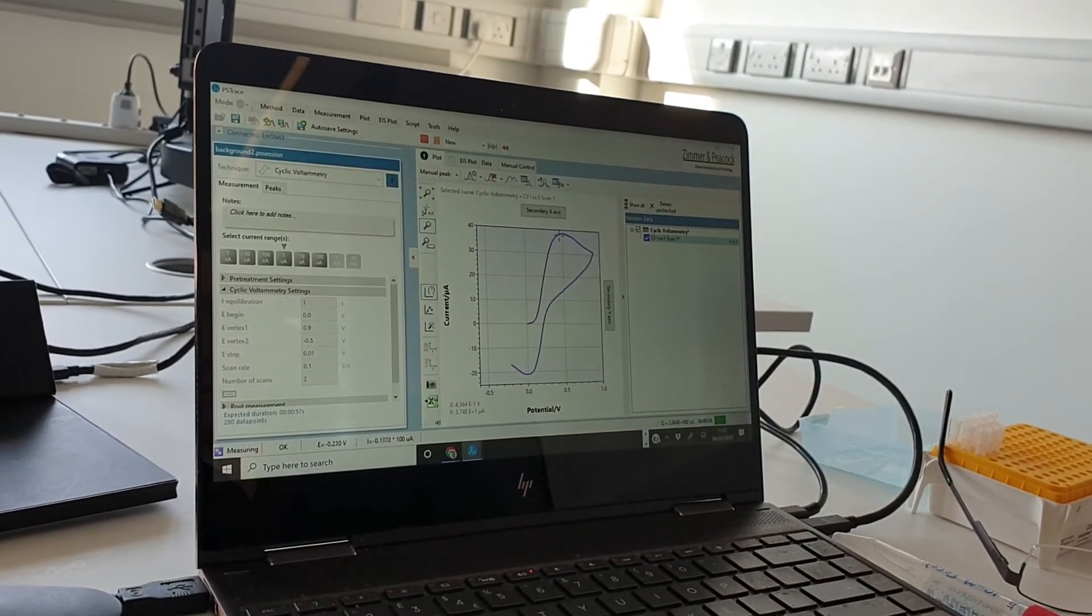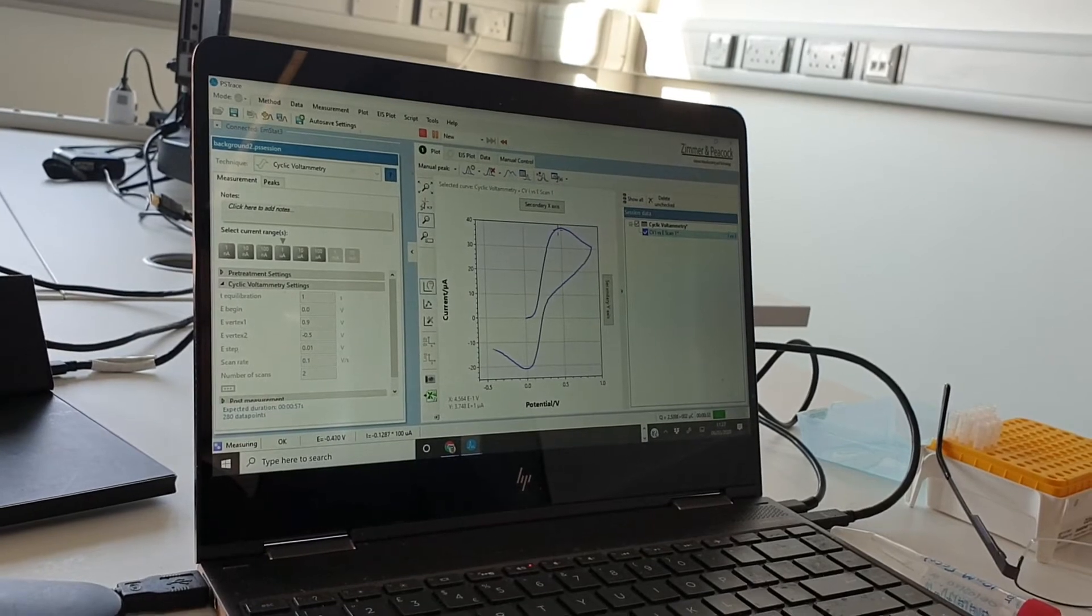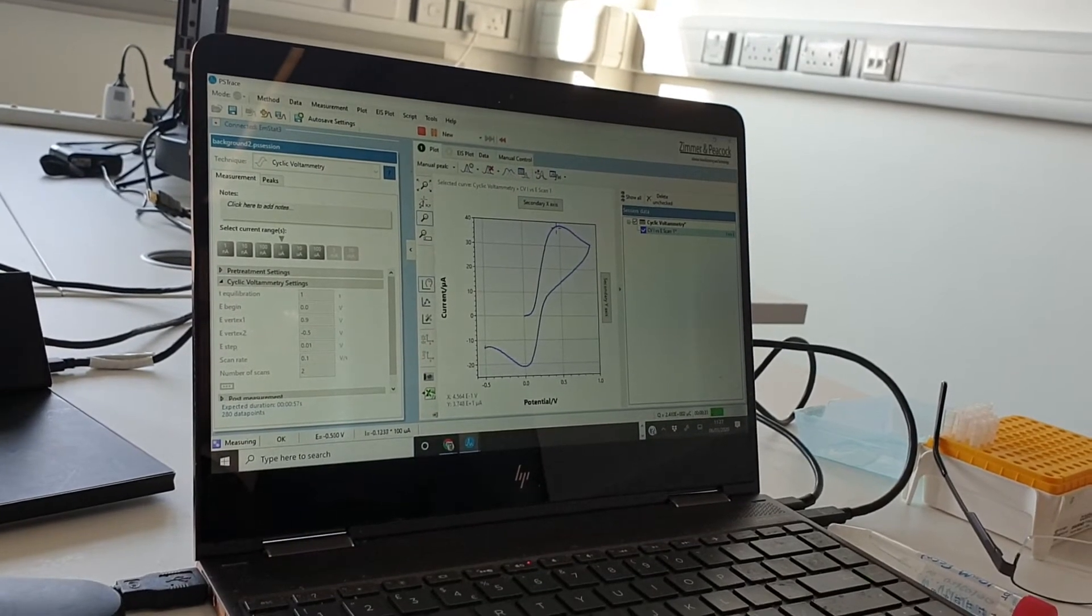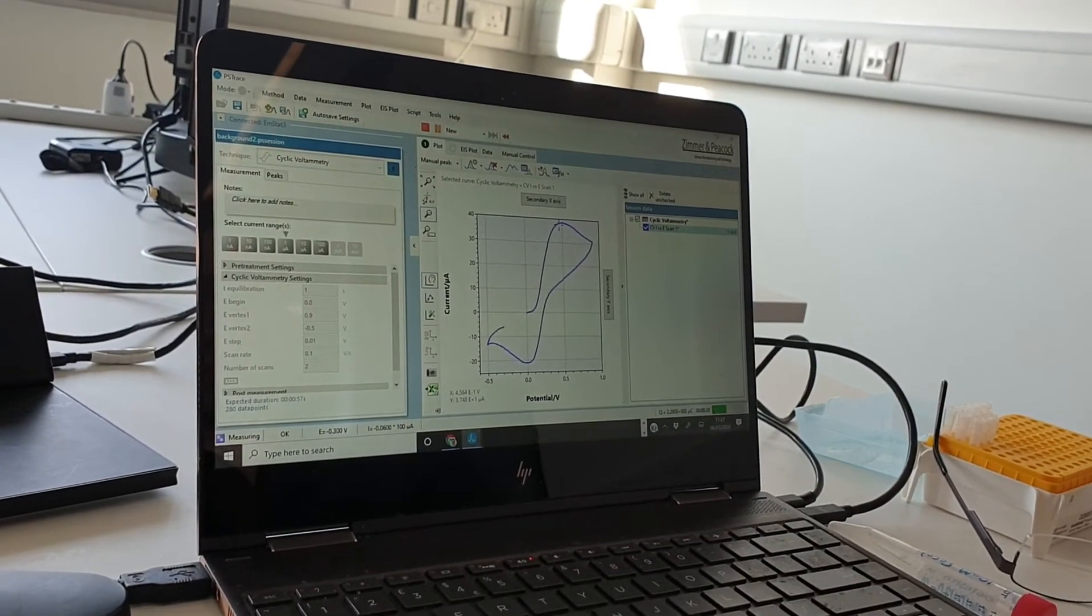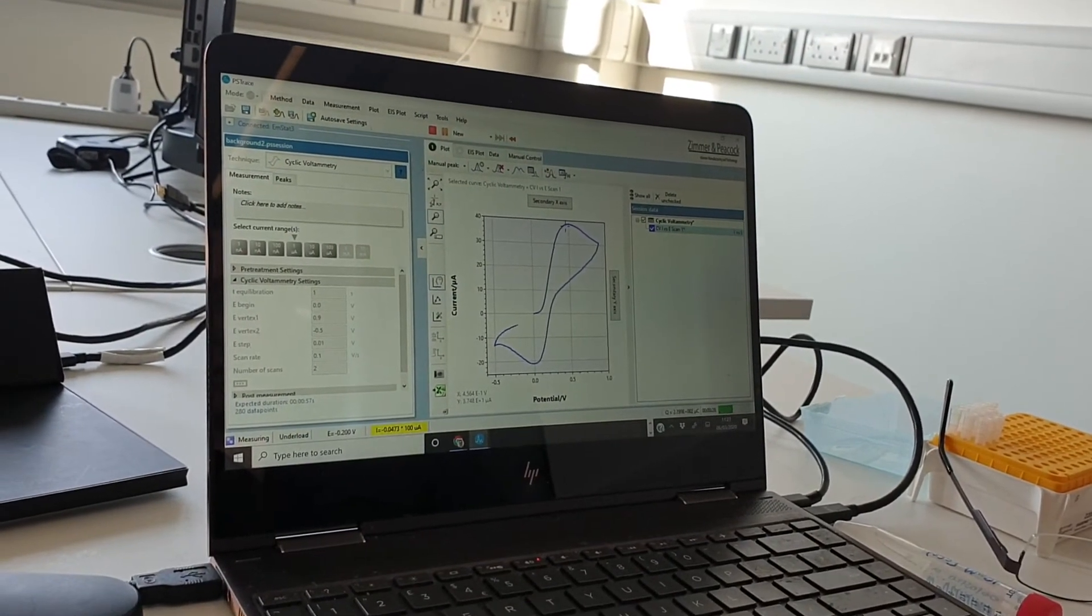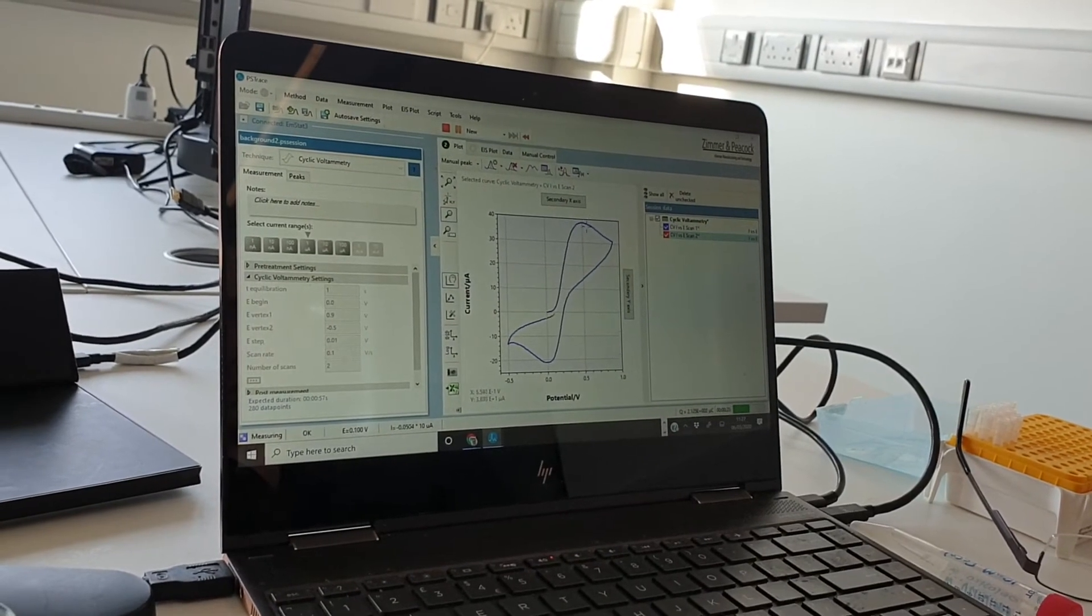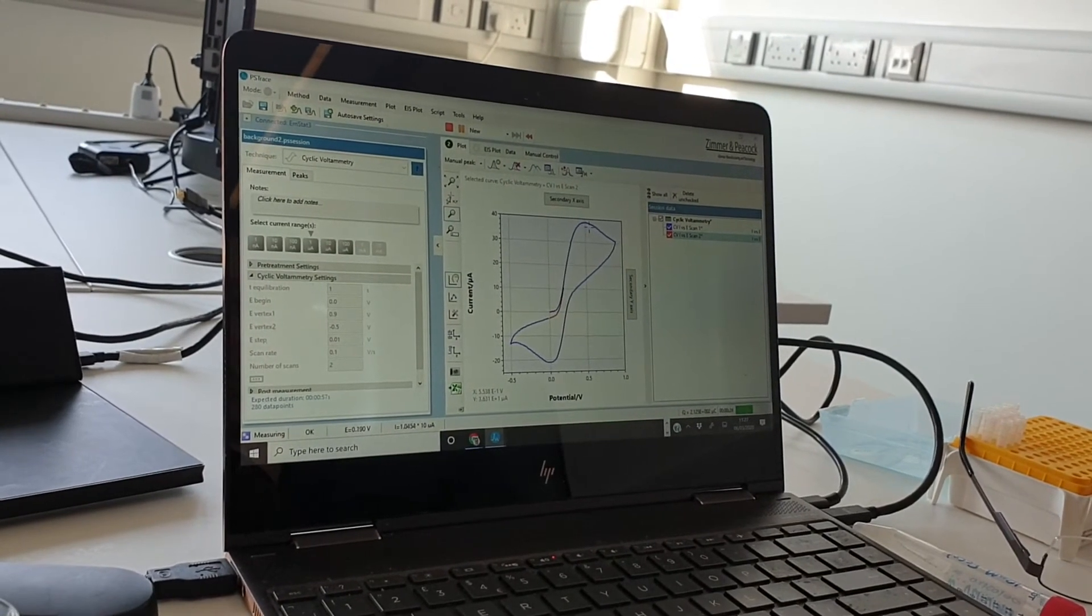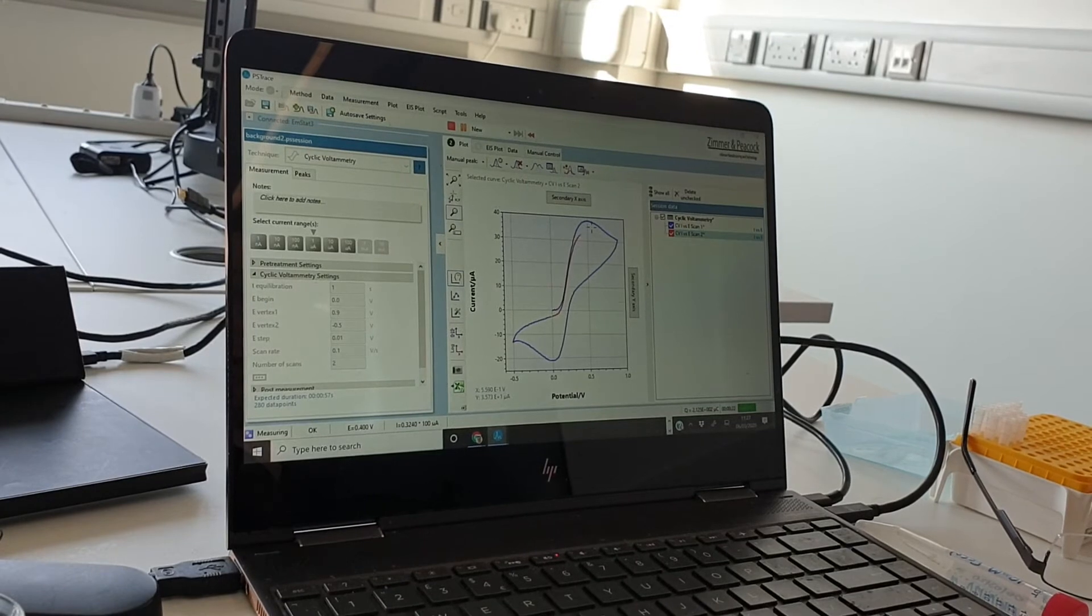This is actually different from what we did earlier on, so you can see the electrode is changing through the experiment. So it's important not to just keep on reusing electrodes. You might have to discard them on occasions or to make your results more statistically important you might have to do the experiment several times.